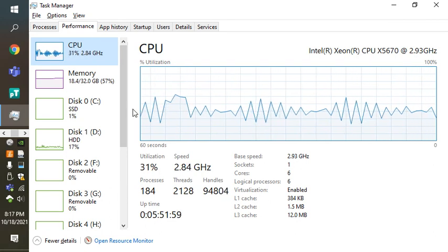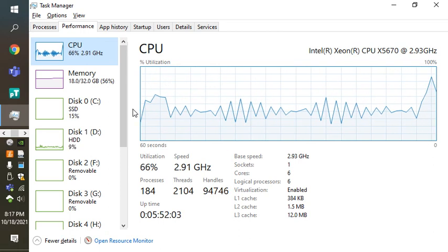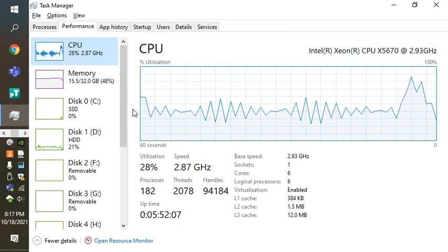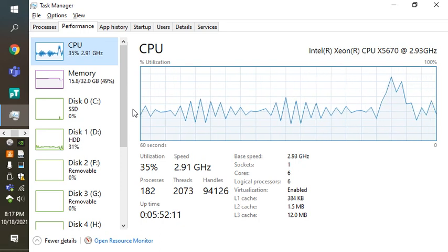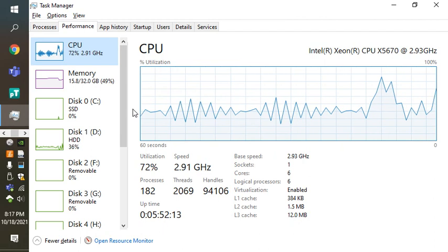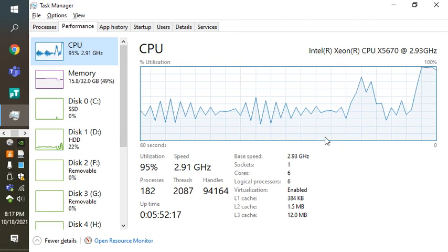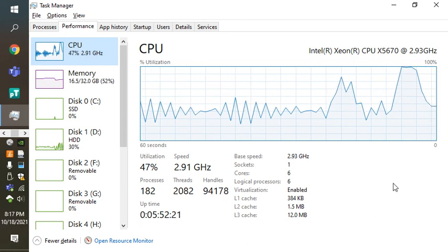it does seem odd that somehow the loading of these spectra into RAM should take a long time. But remember, it's not just creating a copy in RAM of every raw file on disk. It has to do an indexing of these spectra as well. And here, having finally finished the read, we see the big blast of CPU usage that represents the search itself.